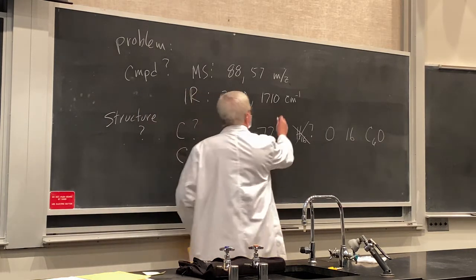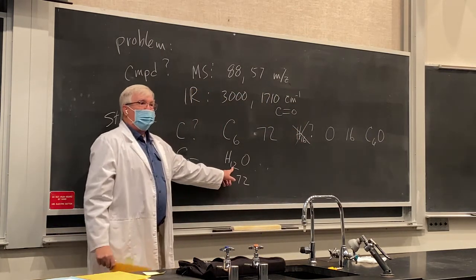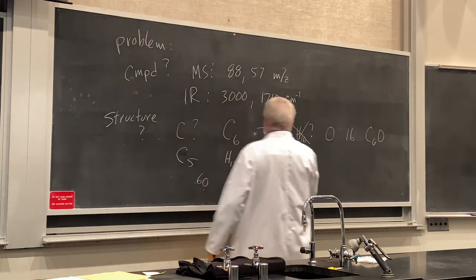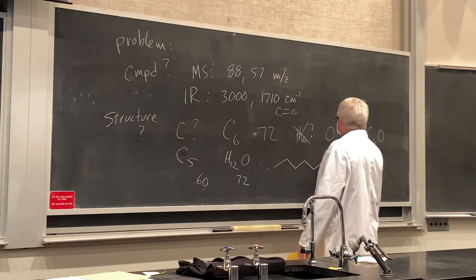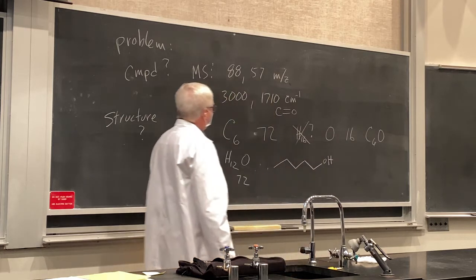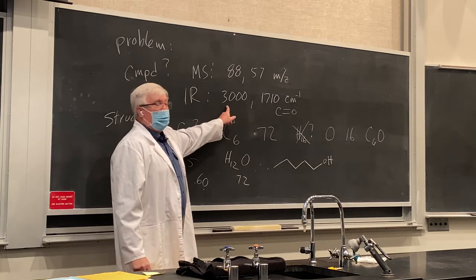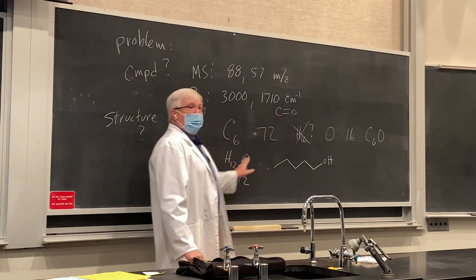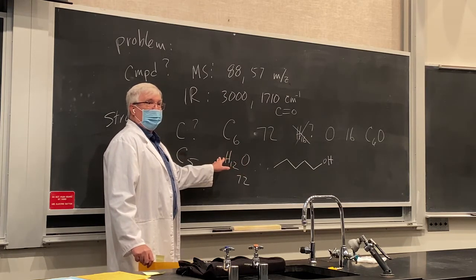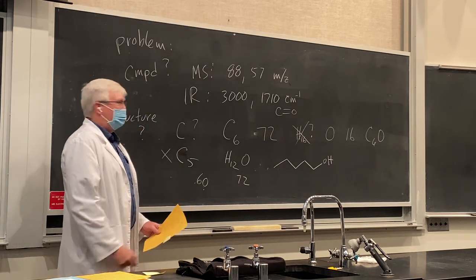A unit of unsaturation. We need a carbonyl, right? We wouldn't be able to have the carbonyl right here with this, okay? You can propose some structures for this, but it looks something like this, right? Count them all up there. I think that's 12 hydrogens and what? There'd be an alcohol. It'd be a 3,500 here and no carbonyl. So even though this is a good ratio of atoms, and there are a lot of known compounds for this formula, this one is also a problem, okay?